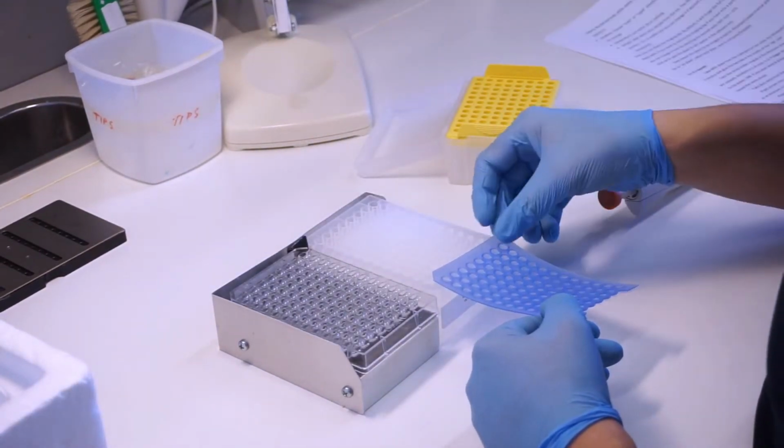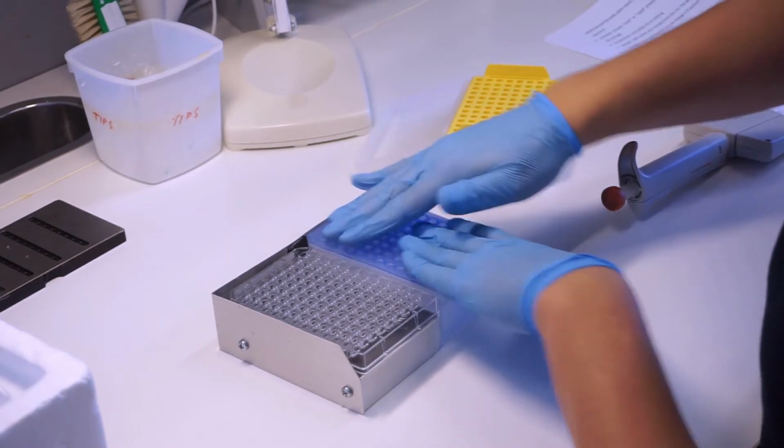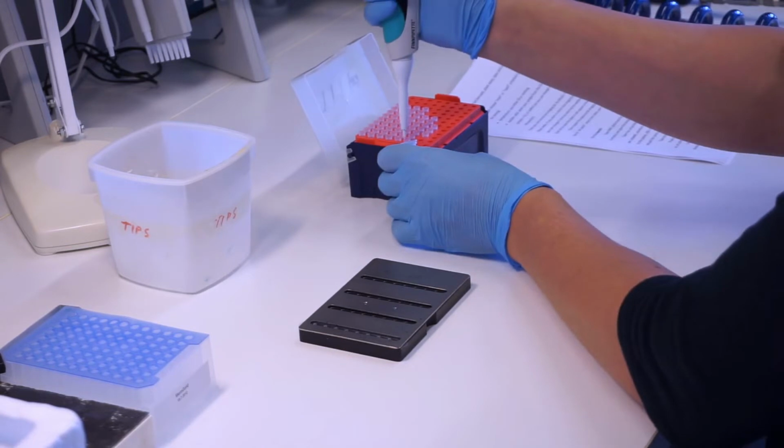Cover the plate to keep away from dust and evaporation while waiting for setting up with the mosquito.